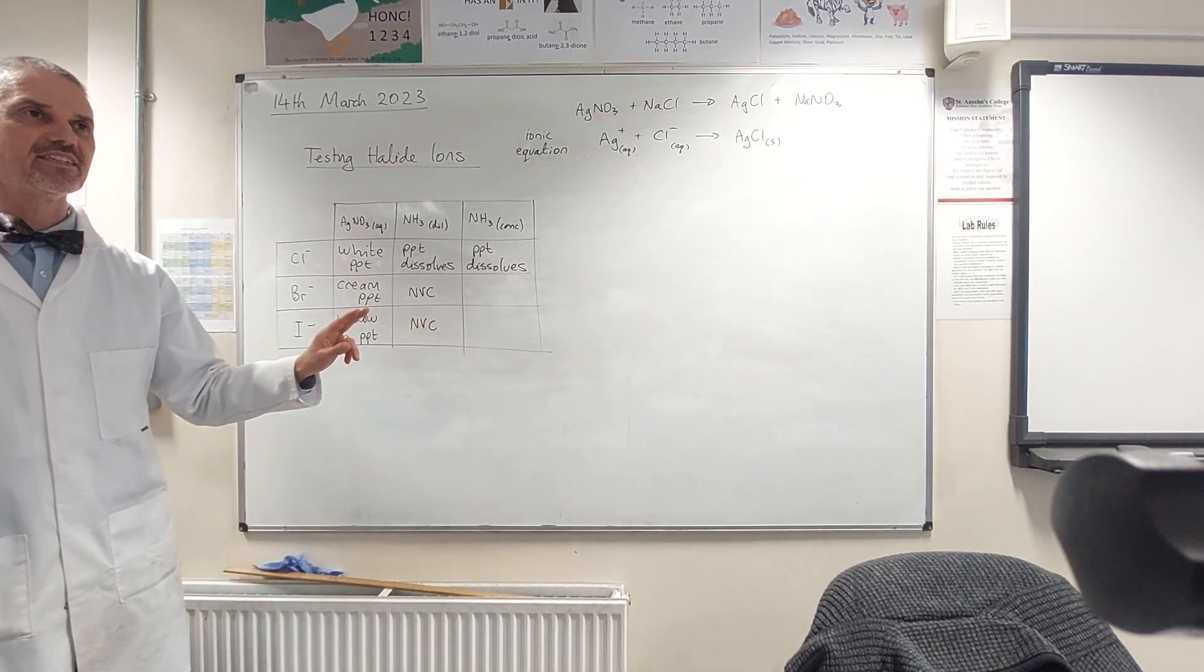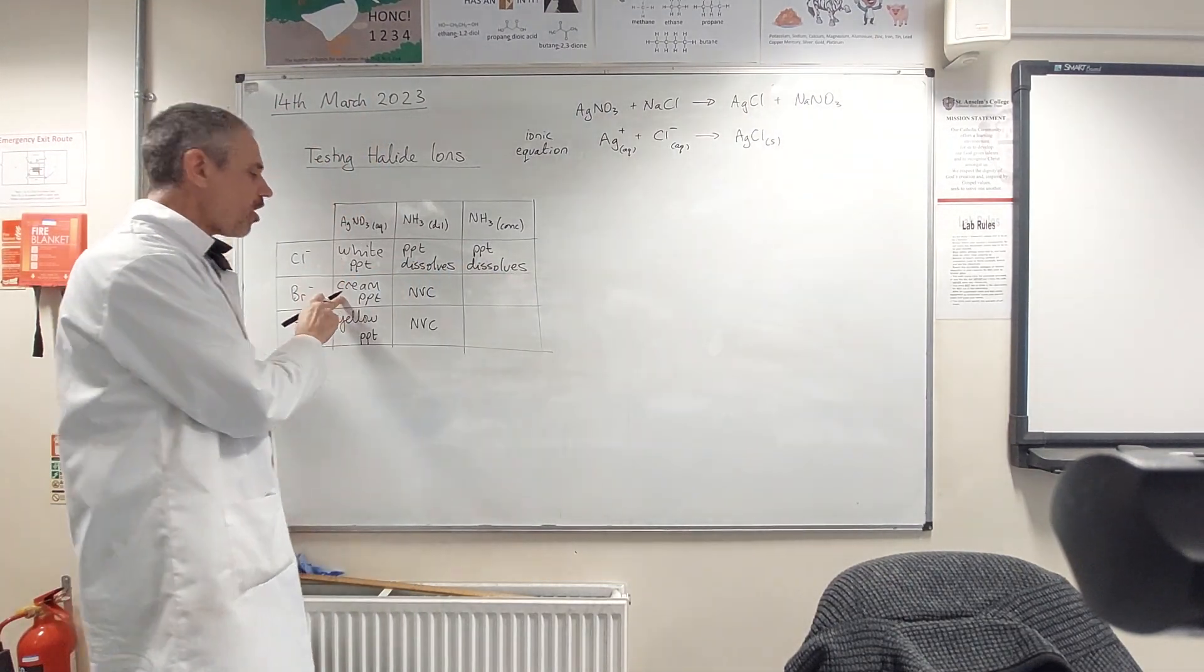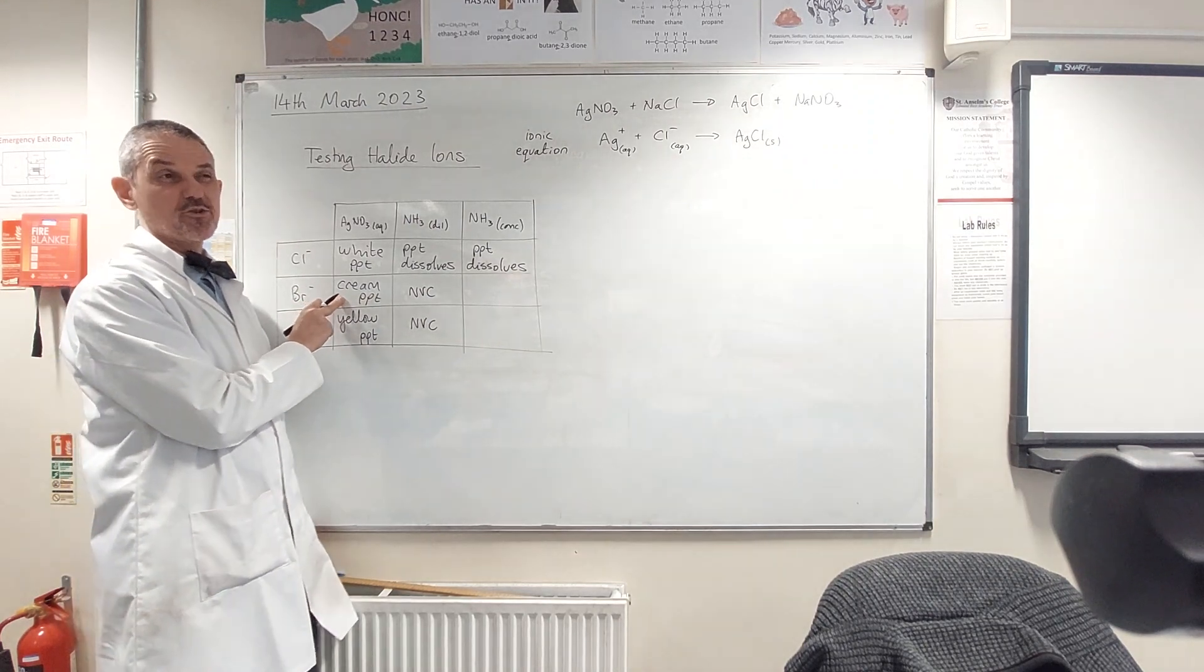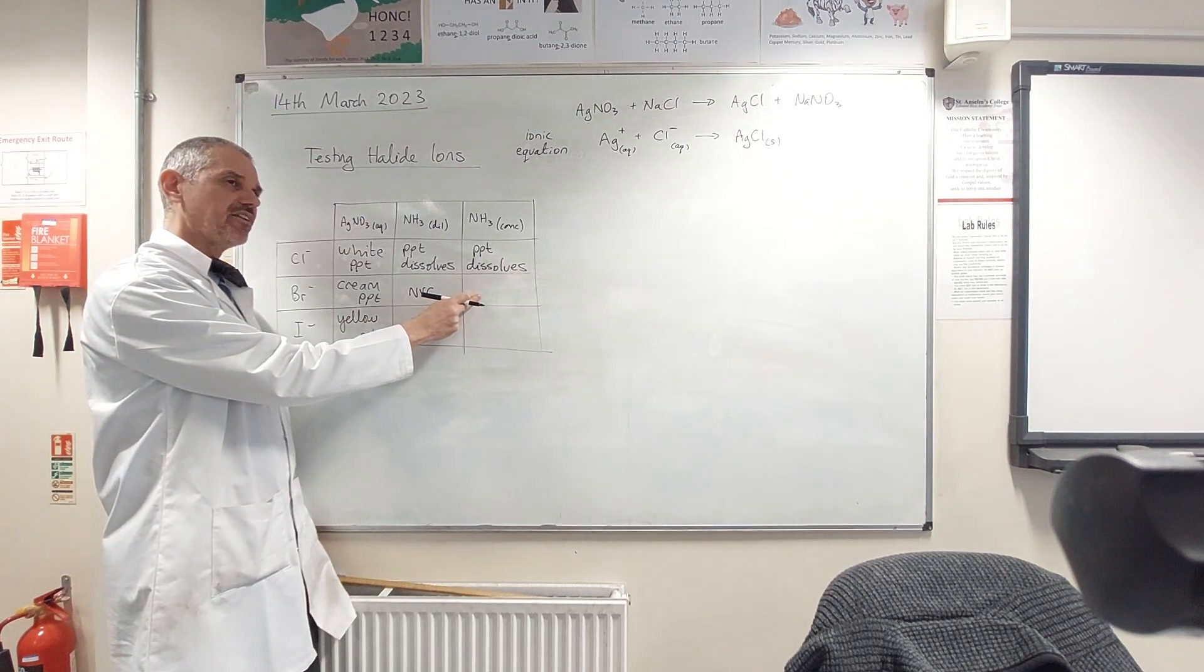What happens with bromide? We've already got a white precipitate. Sorry, we've already got a cream precipitate. We're adding the cream precipitate to conch ammonia.